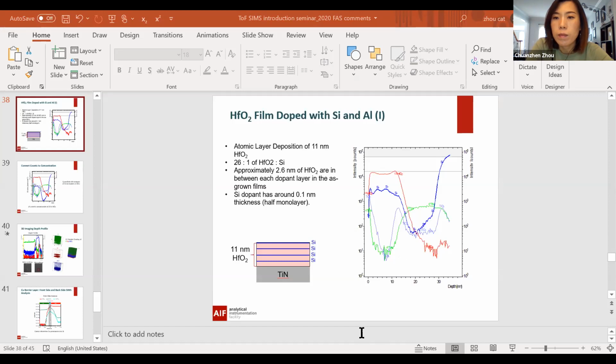Elaine, this is Dan Sand with Loperex. Your talk included films and fibers. Is there any limitation to the geometry of the sample that you can run, the topography?